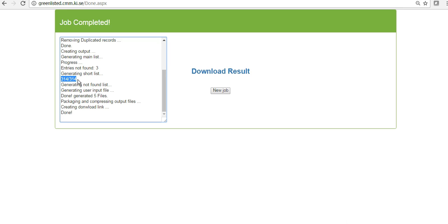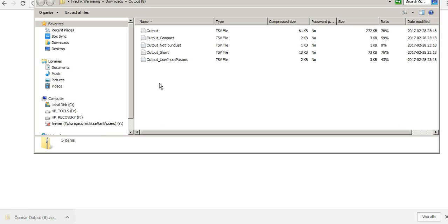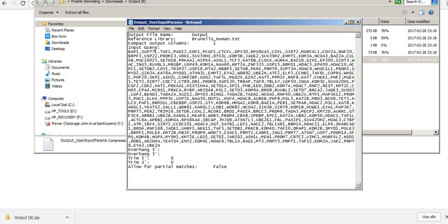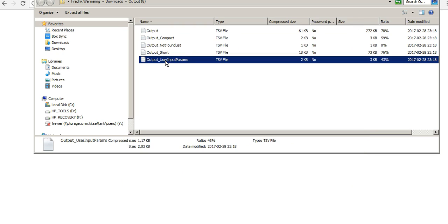It found 314 different of these genes that we wanted to target. Three of them were not found. And download the result. Here in the output user input parameters, you can just see what it was that you asked for, which genes you wanted to target, which library was used, etc. So it's a good file to keep here.